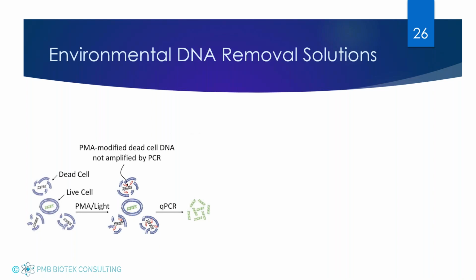And they're not viable for all methods. So these types of techniques usually aren't employed in quantification PCR. So when you have methods that are for like total aerobic count, total yeast and mold, total coliform, you shouldn't be running an environmental DNA removal solution. You should be looking at maybe one of the other techniques we discussed to really eliminate background. These should be more for presence-absence tests.